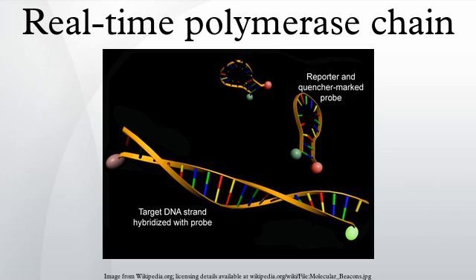Northern blotting is often used to estimate the expression level of a gene by visualizing the abundance of its mRNA transcript in a sample. In this method, purified RNA is separated by agarose gel electrophoresis, transferred to a solid matrix, and probed with a specific DNA or RNA probe that is complementary to the gene of interest. Although this technique is still used to assess gene expression, it requires relatively large amounts of RNA and provides only qualitative or semi-quantitative information of mRNA levels.